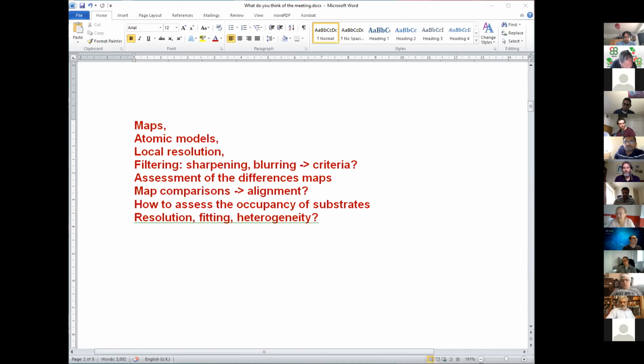But I do believe even if you have an average, integral assessment that your map is about 3.5 angstrom, it means that you cannot do sharpening as high as, for example, 3.2 angstrom. Otherwise the rest will be non-realistic features. But even from my point of view, keep in mind that it's a problem in real life.